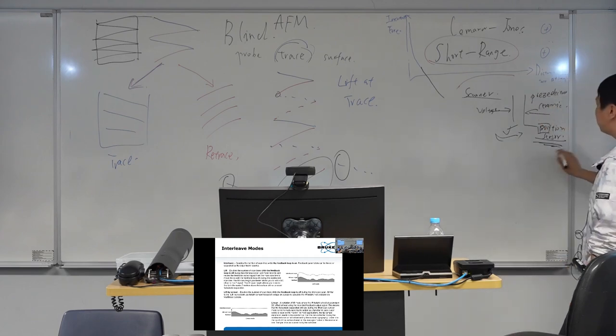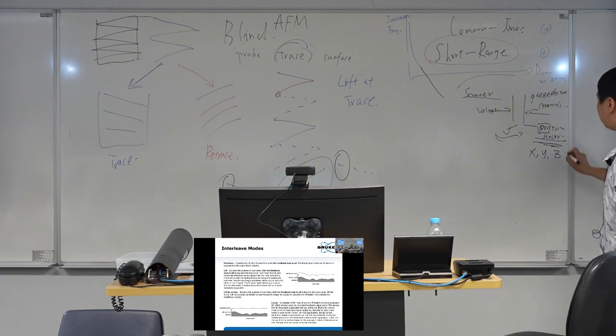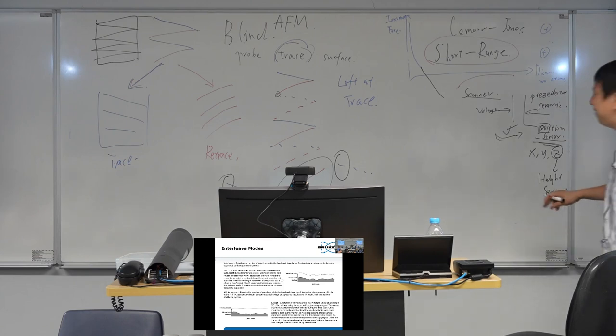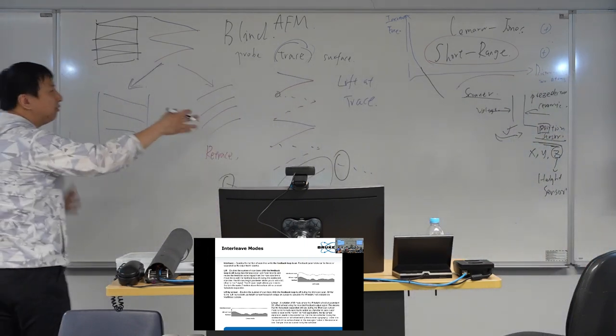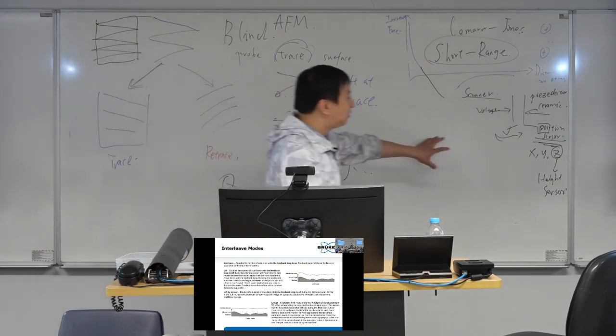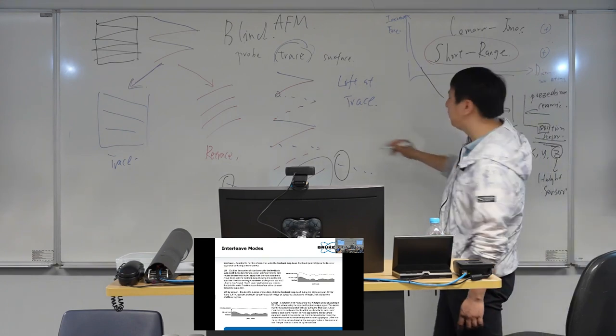And this position sensor, we have three of them, X, Y, and Z. And the Z position sensor is quite famous to you guys. That's the height sensor channel. That's every AFM image you kept when you were playing around the icon in MCPI, right? That's the morphology. So every channel we have these XYZ position sensors. So let's go to our lift.